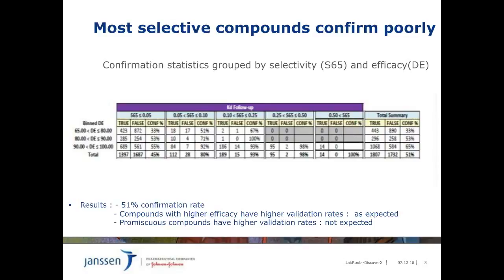In the next step, we had to select the compounds for the confirmation KD determination round. To this aim, we selected around 3,500 compound kinase interactions for KD determination. Obviously, we wanted to focus on the most potent and selective compounds and also impact discovery projects of immediate interest. From the 3,500 dose-response curves, we observed a 51% confirmation rate.